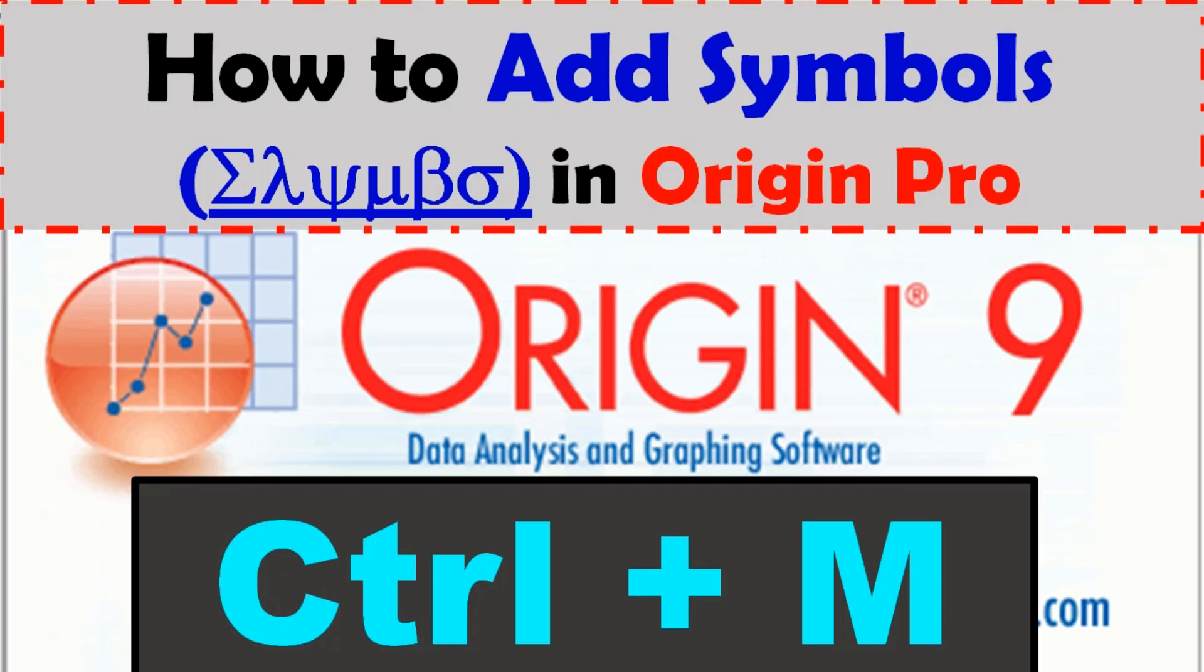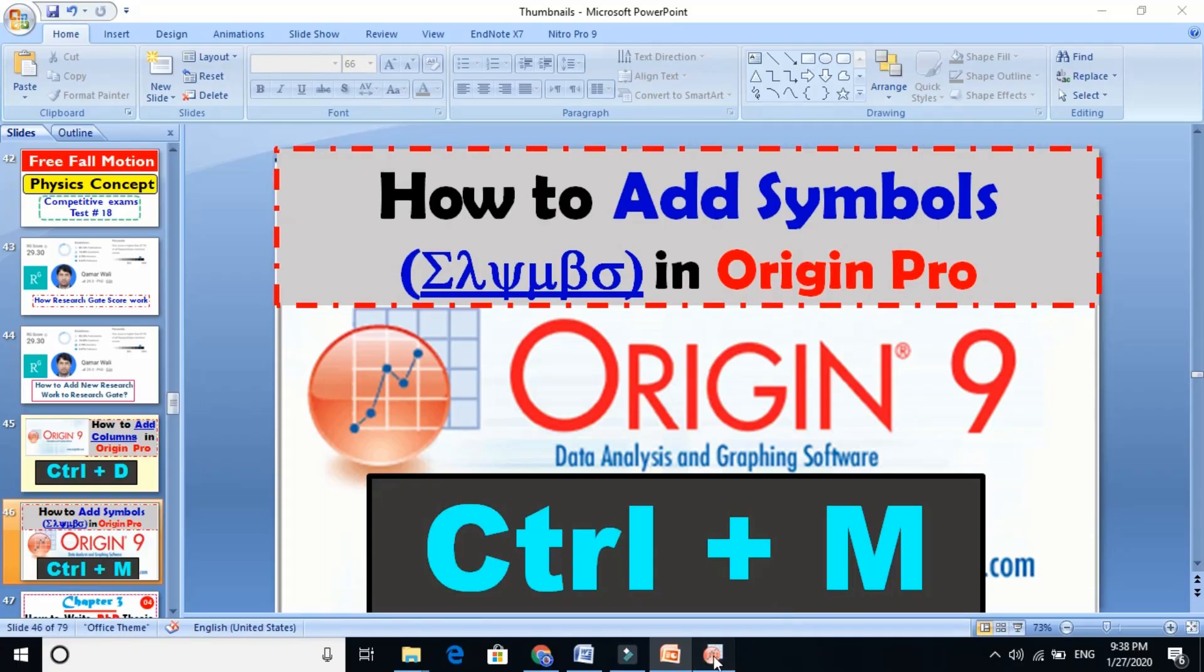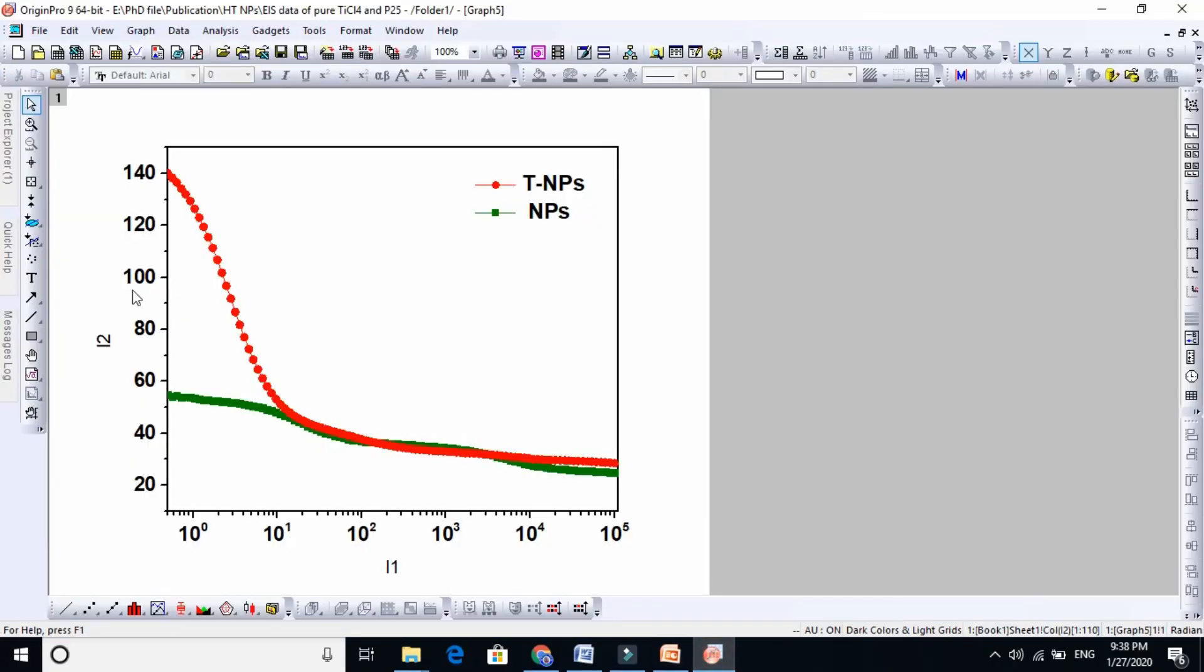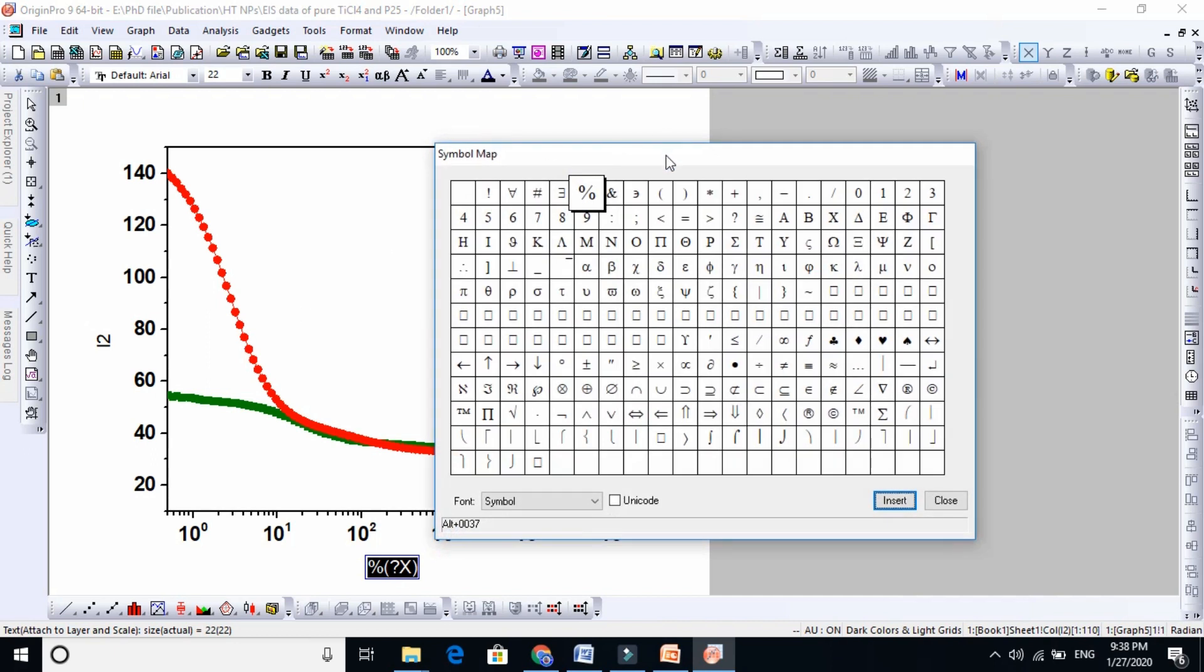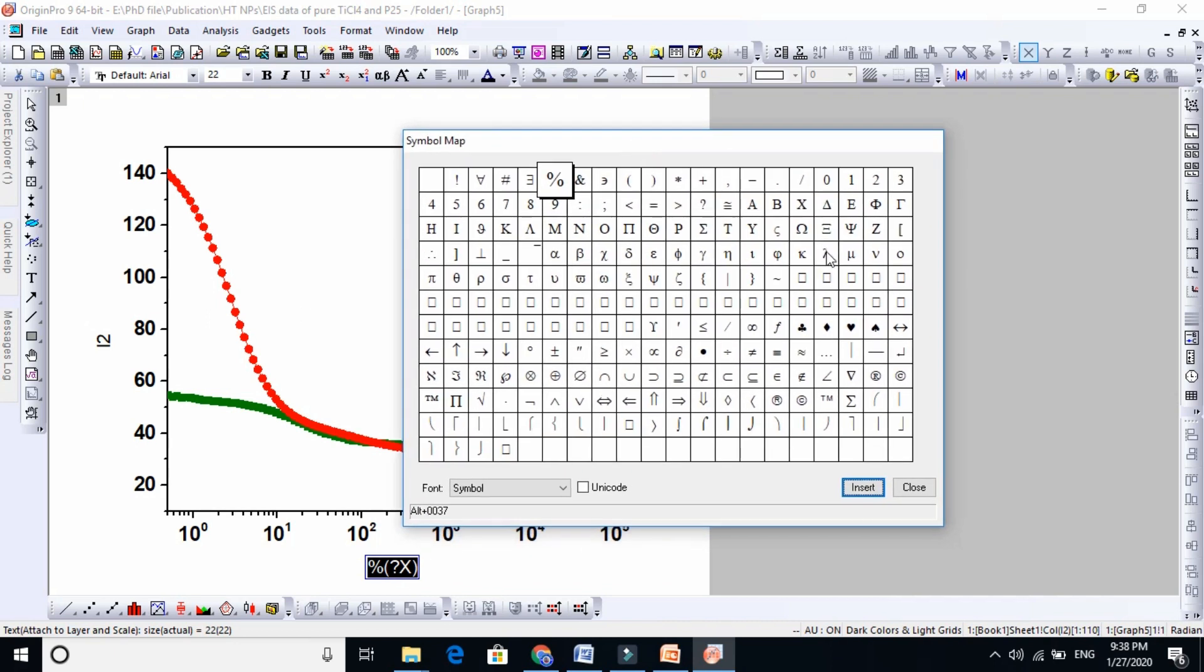Let's show this in real time. This is the graph, and if I want to put wavelength here, we need to put lambda. Just press Ctrl+M, so a new window will open here and this is the lambda.